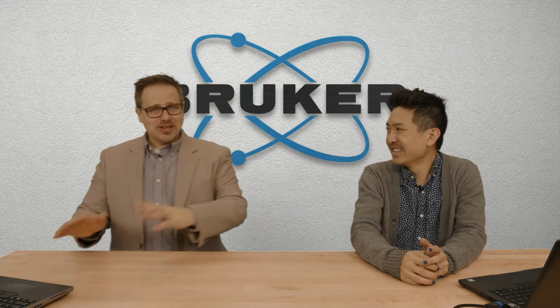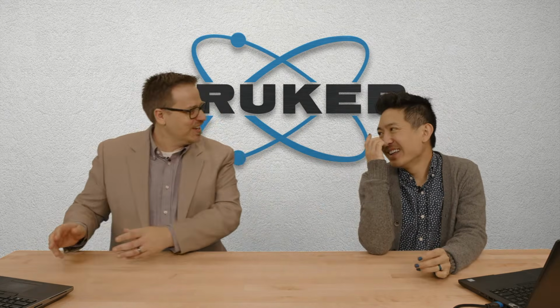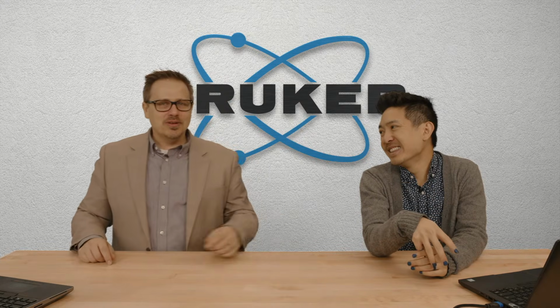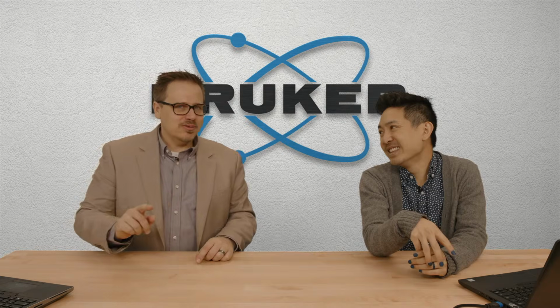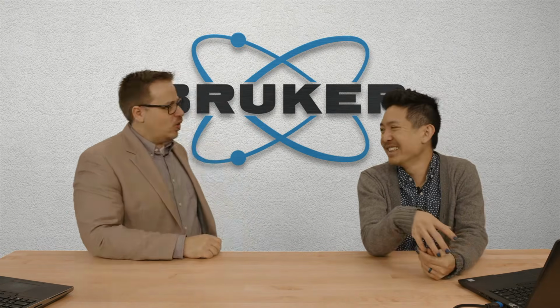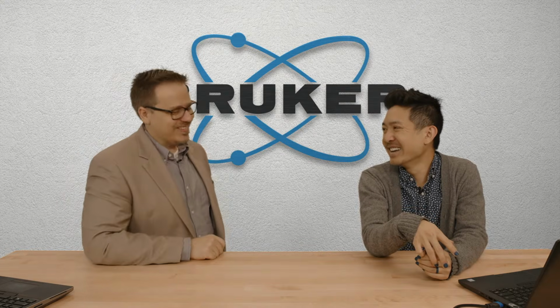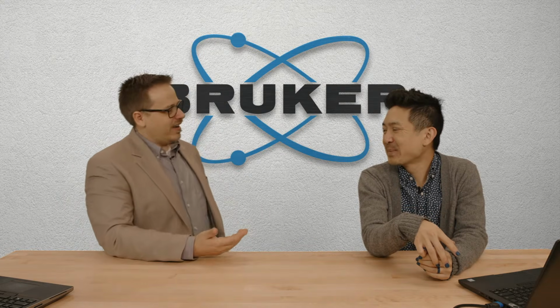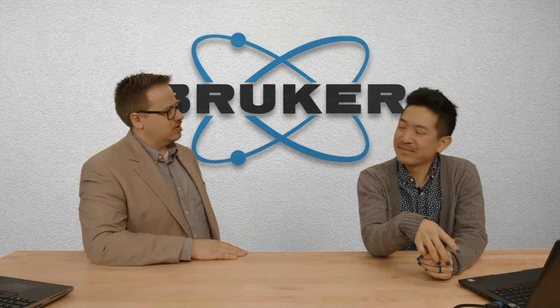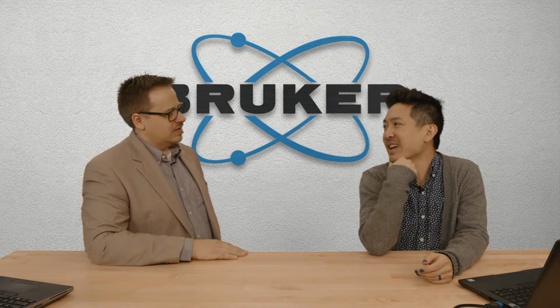And you're like, well, how about we just do the exercise? Let's just do it. And then sure enough, you run it, and they're like... But then you go, but by the way, did you know there was 2.5% of this? Oh my gosh. No, but that explains a lot. Right? So phase ID by eye, it requires somebody who's been doing it for 30 years. Well, the other thing is, as a synthetic chemist, you still need scientists to make the material. That is true, Nate. That is true.